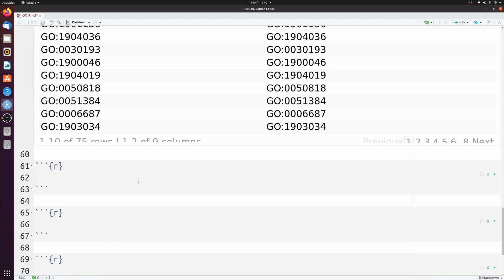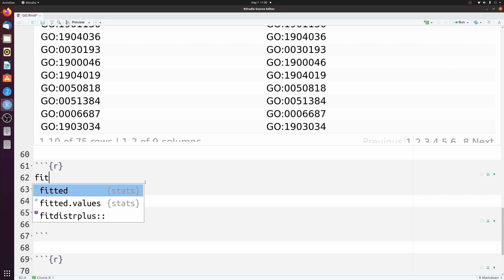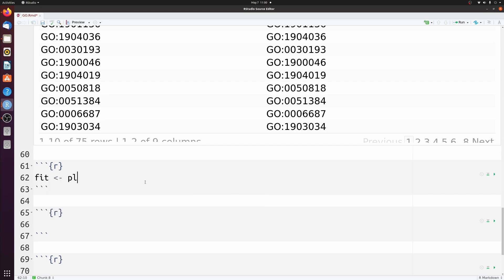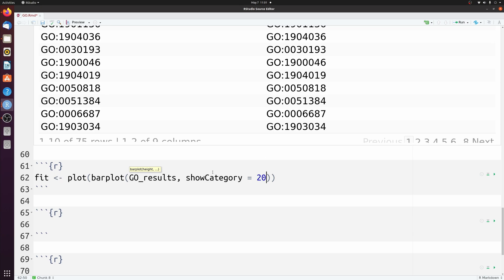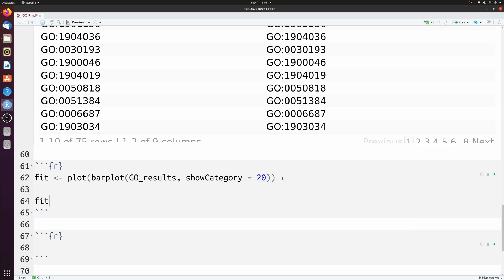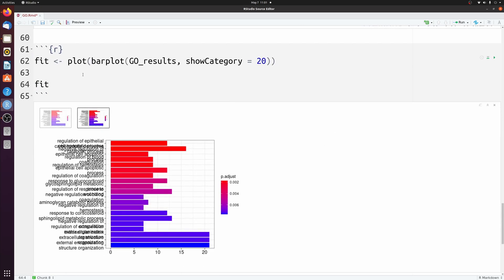We can plot this in a nice bar plot. Let's make something called fit and then call barplot on go_results, passing show_category = 20, so we get the top 20 categories plotted. Let me save this to a file and bring it up so we can see what it actually looks like.